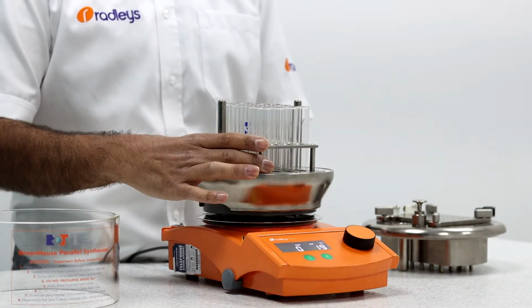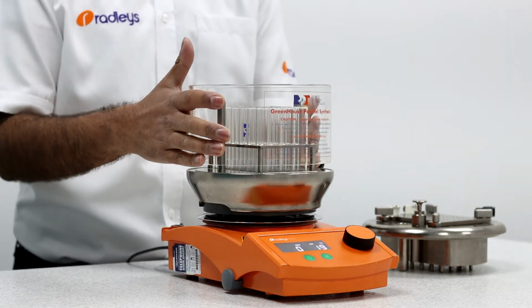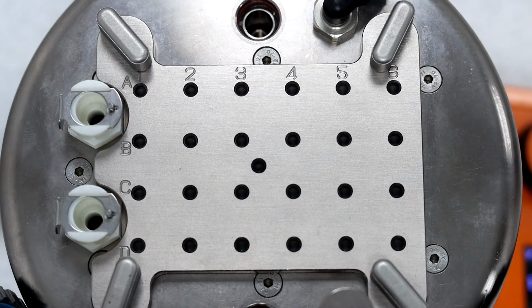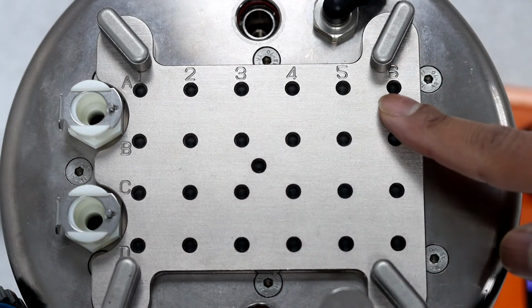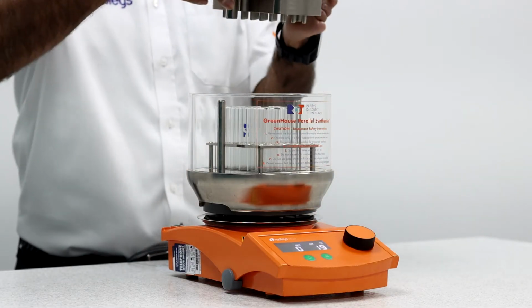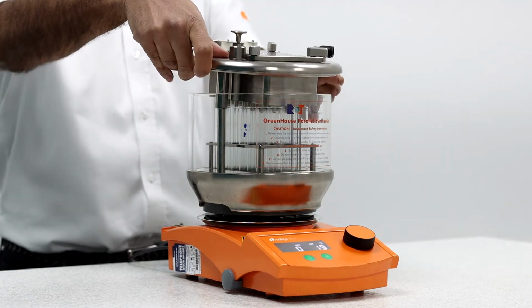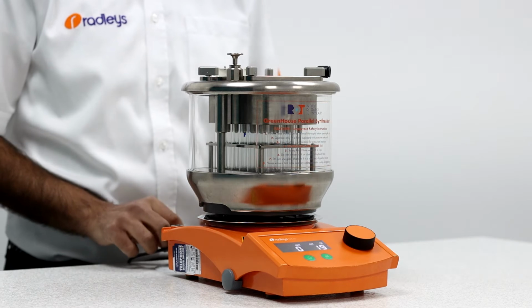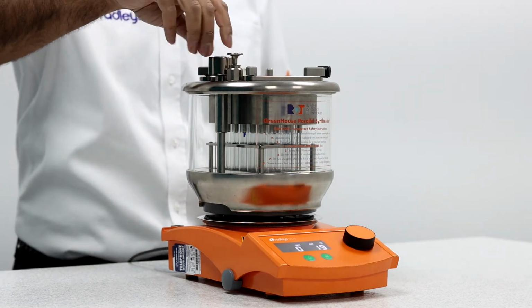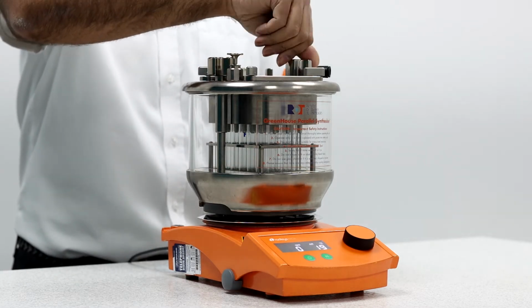Once your reaction tubes are in the base, place the glass cylinder onto the base and then place the reflux head into position on top, taking care to align the alphanumeric numbering on the head and the base unit. To make things easier, it's best to use the locating pillars when placing the head into position. Using these two sealing knobs, secure the head and ensure that there is a gas-tight connection. The sealing knobs only need to be hand tight, so there's no tools required.